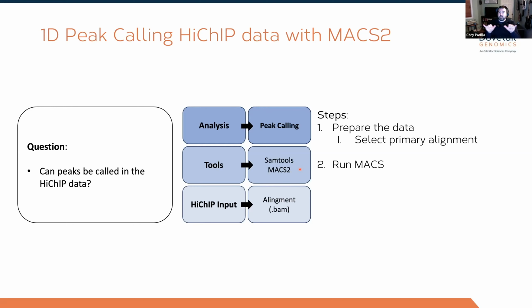Because that's how you make ChIP-seq libraries. With HiChIP libraries, read 1 falls within that anchor, but read 2, like I mentioned, falls someplace out in topology space. And so it doesn't like that really long distance between your 2 read pairs, so it ends up throwing out a lot of data, or it won't even run just because it says the insert size is too big.